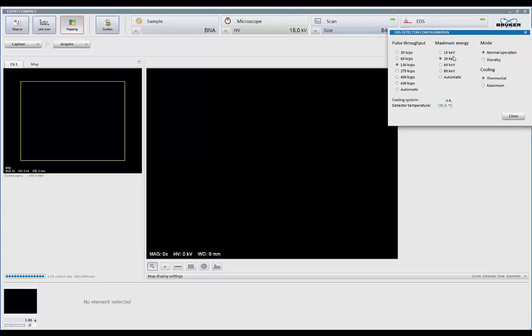This divided into your energy range gives you your EV per channel. So we collect 4,000 channel spectrum at all times. So you can have 2.5, 5, 10, or 20 EV per channel. Mode turns the spectrometer on or off.